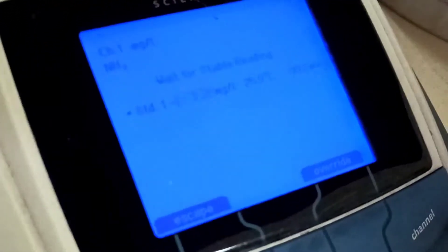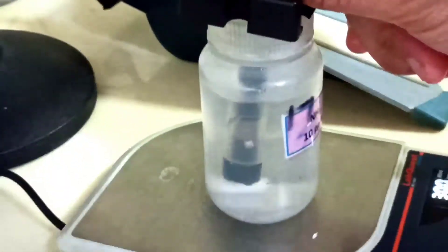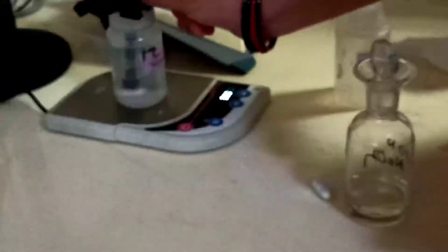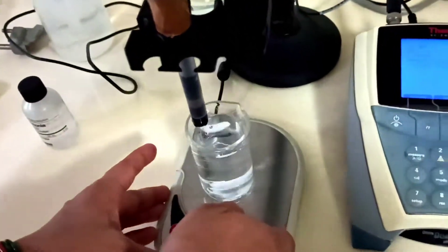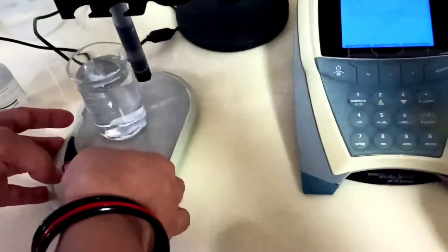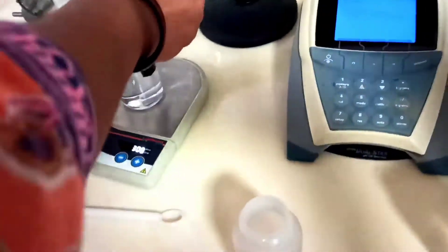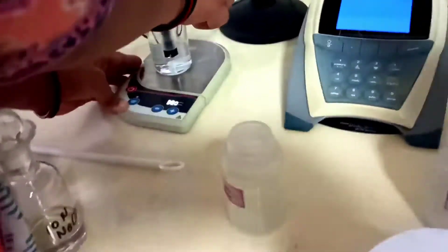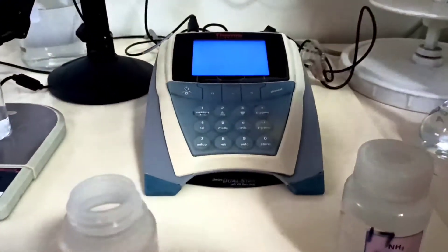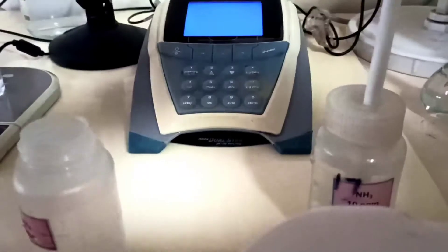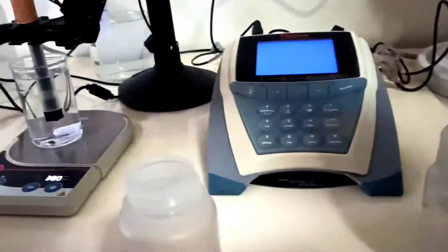Now we completed our first standard calibration and we get the result. We get 99.2 millivolt. At every operation we clean our ion selective electrode with distilled water. It is very important for depolarizing our ion selective electrode to get accurate and precise readings.